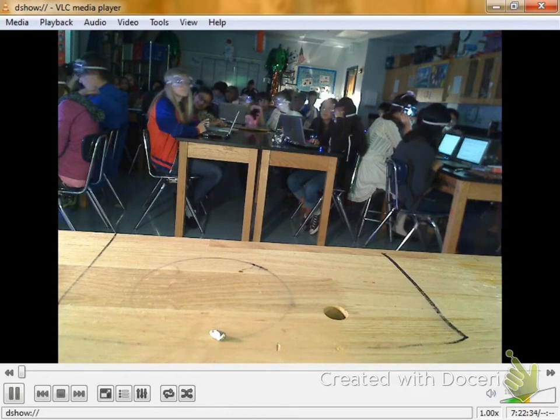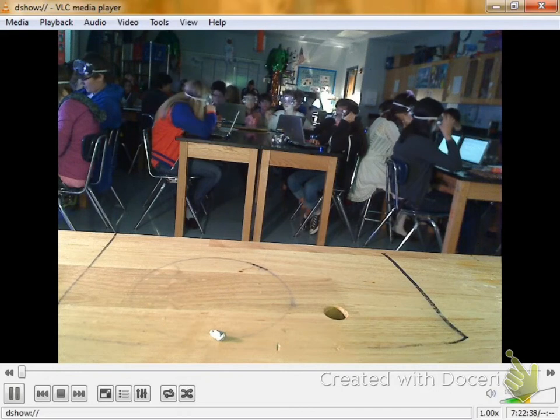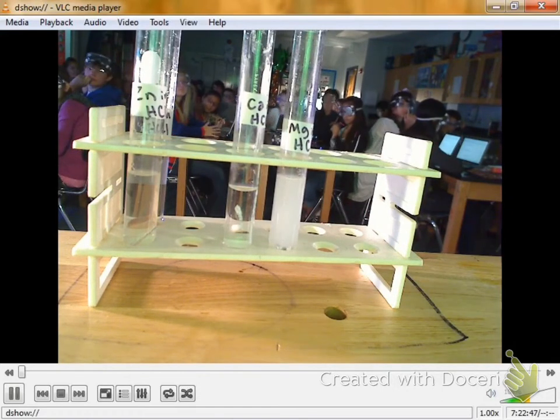Alright, I'm going to put this piece right here for now. Bring back the hydrochloric acid. Y'all ready? You gotta be watching, because you may end up missing. This is calcium and the hydrochloric acid.